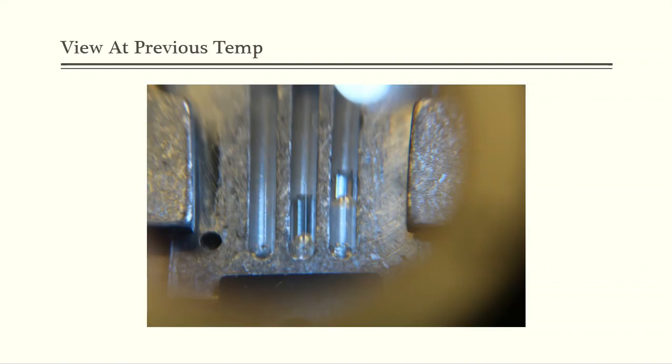All right, so finally, here is that image of 121.9. So there's your crystals, folks. There's your recrystallization technique. I'm glad that you helped me out in this process. So you now are aware and have some understanding of recrystallization. You now know the purpose in us doing it in a laboratory, and you now know how we confirm if something did truly get recrystallized, and how we can prove it in a laboratory setting.